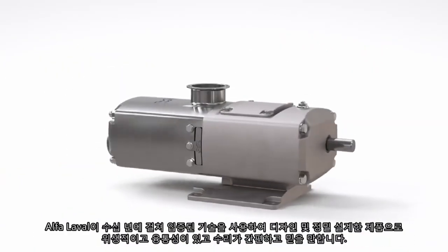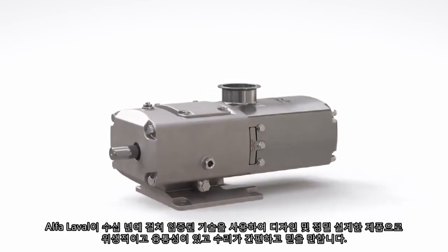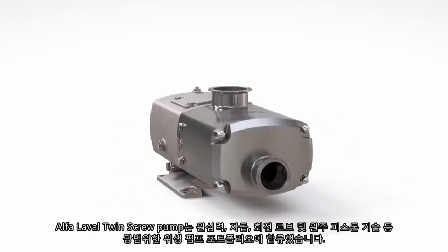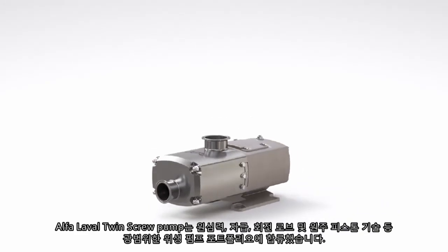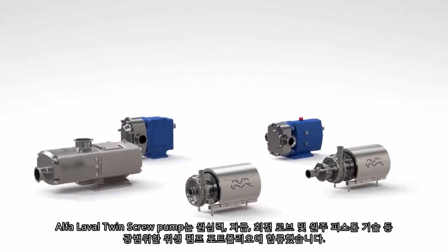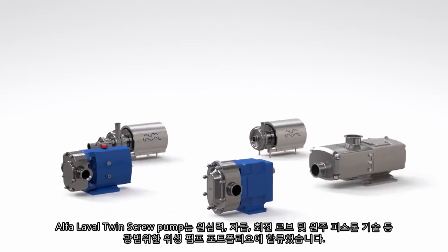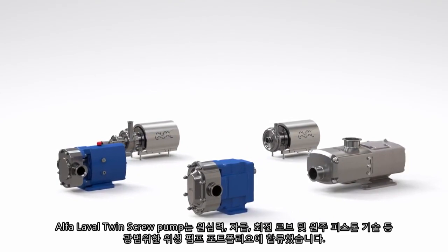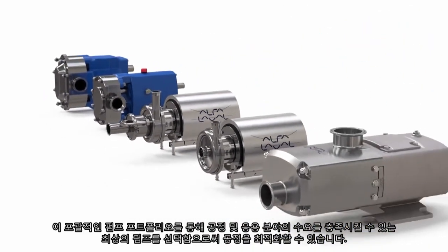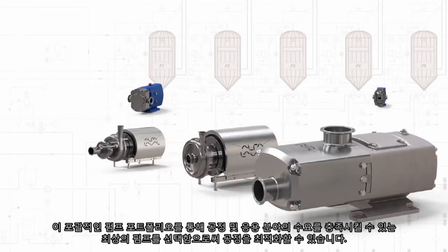Designed and precision engineered by Alfa Laval using decades of proven technology — hygienic, flexible, easy to service and reliable. The Alfa Laval twin screw pump joins a broad hygienic pump portfolio including centrifugal, self-priming, rotary lobe and circumferential piston technologies. This comprehensive portfolio lets you optimize your process by choosing the best pump to meet your process and application needs.